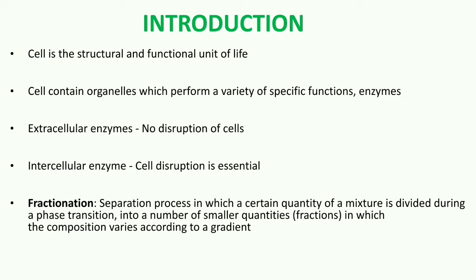The different organelles of the plant cells will have different densities, and in density gradient centrifugation will occupy different layers. We can isolate the layer which contains the plastids, which contain the enzymes for photosynthesis. Hence, we separate out that layer and subject it to further purification steps.